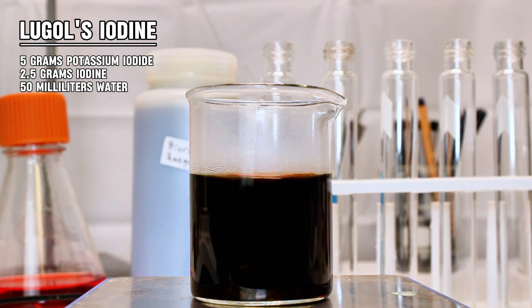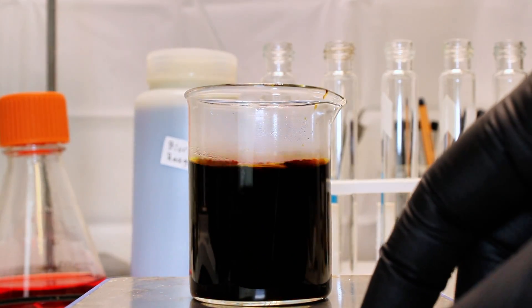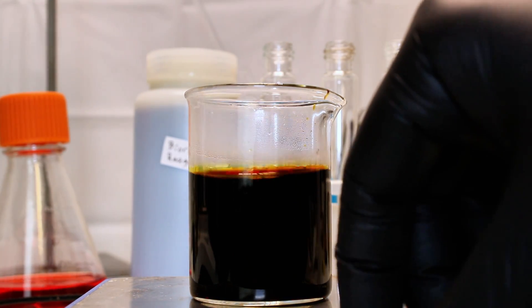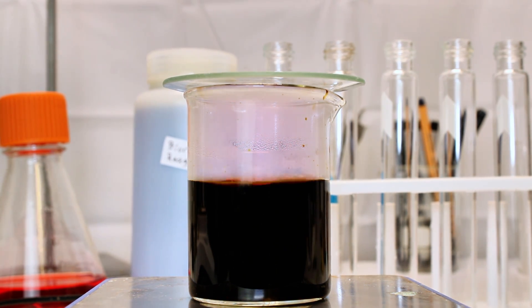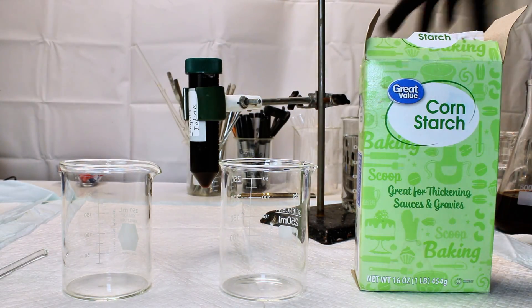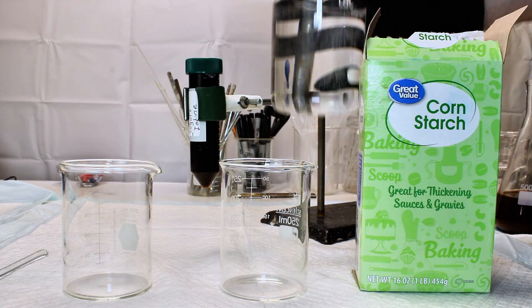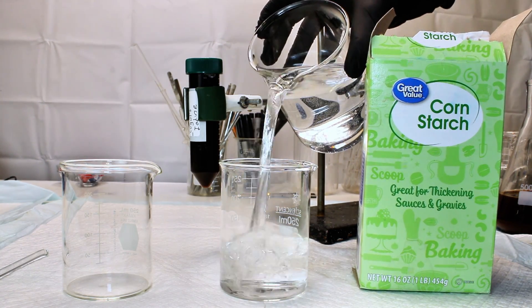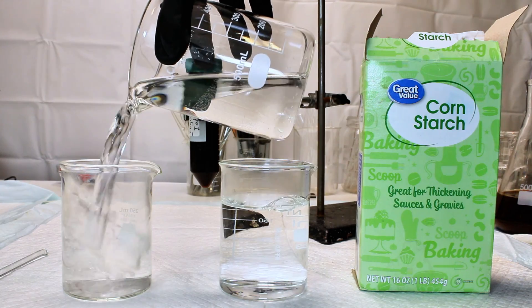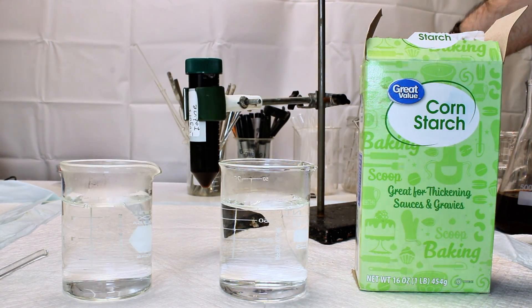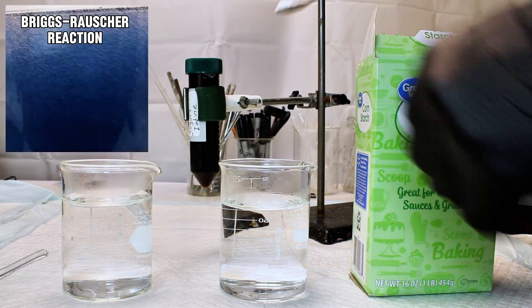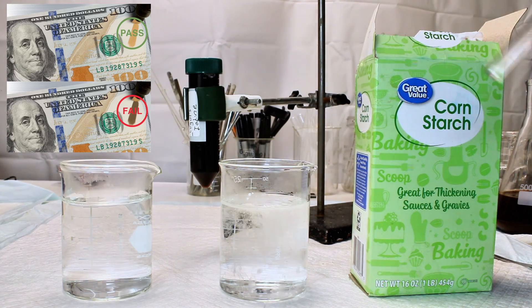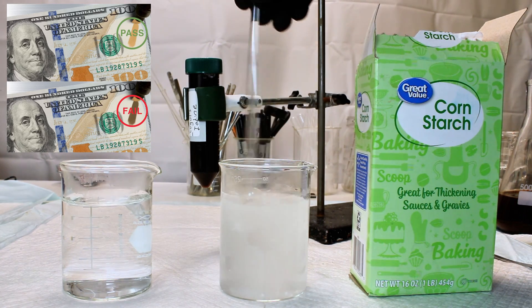This produces a solution where the reactive triiodide ion dominates in equilibrium with free iodine, which makes this solution incredibly useful in various medical applications. However, the way this solution works for my applications here today is that when triiodide reacts with starch, it forms a very, very dark blue complex. This complex does not form if only iodine or iodide is present, which is the basis for iodometric titration and the Briggs-Rauscher oscillating reaction. This principle is also used to detect counterfeit currency, as US dollars do not contain starch, while most regular paper does.